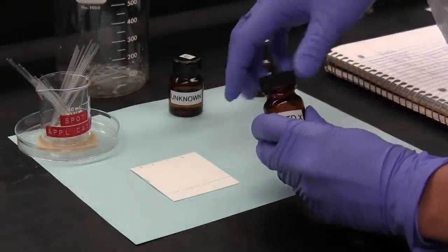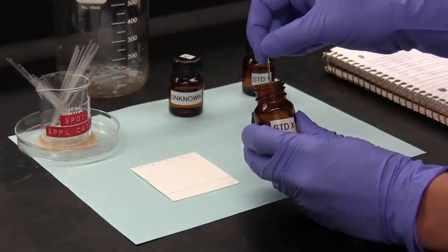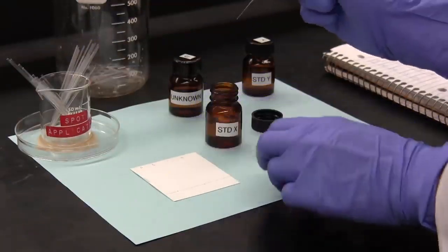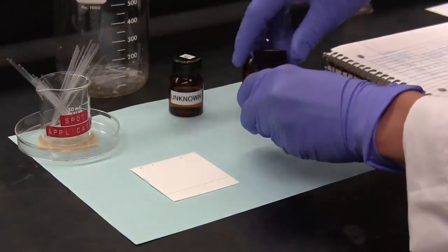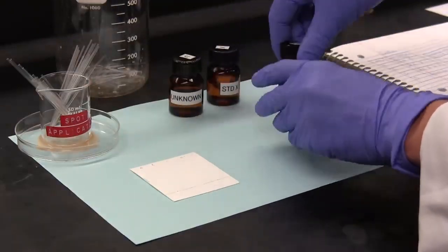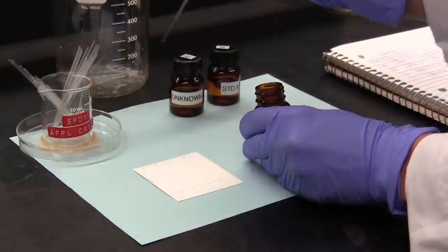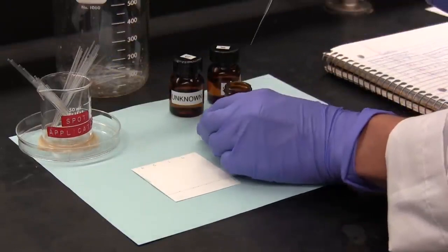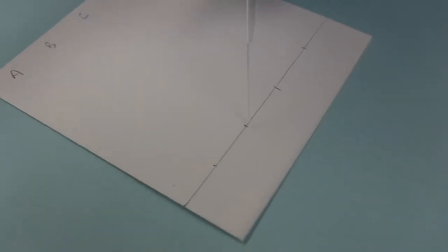The first part of the TLC analysis is to spot the plate. We use a capillary applicator to apply a spot of standard X at the origin in lane A, and again in lane C. Now in lane B at the origin, we apply a spot of standard Y, and once more at the origin in lane C.